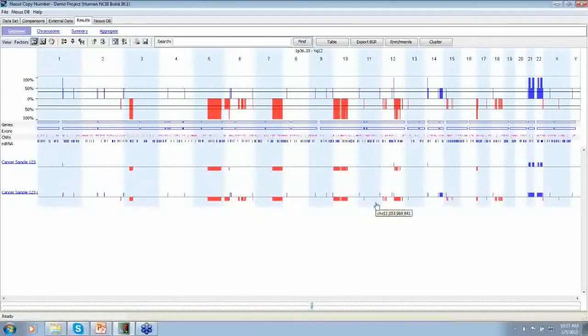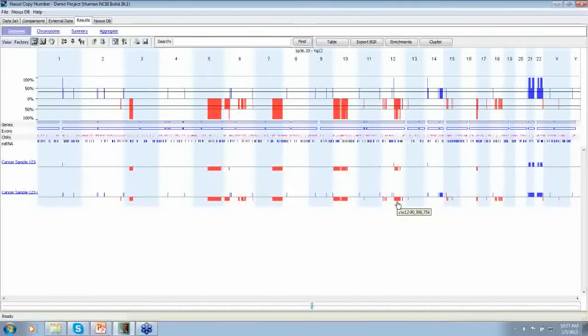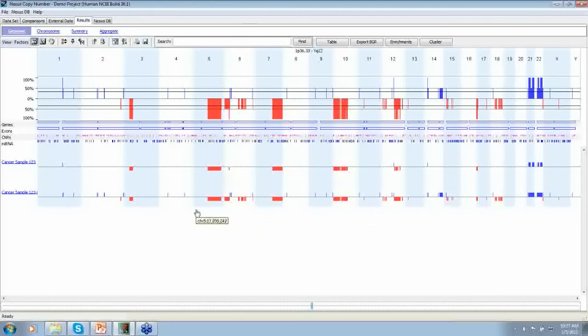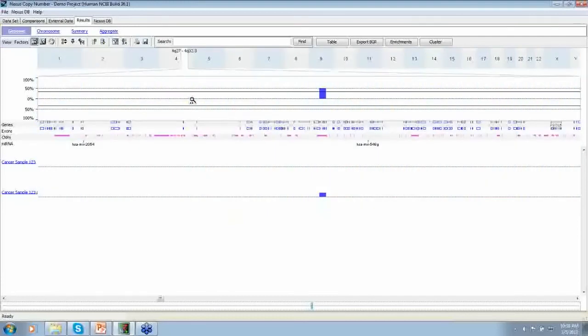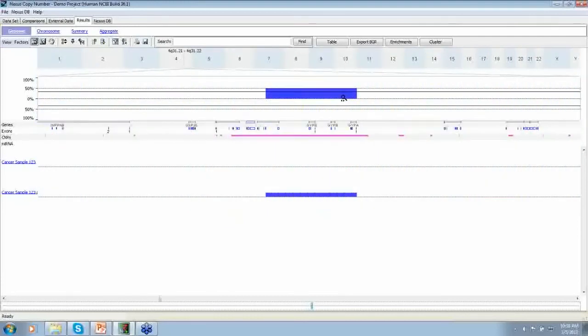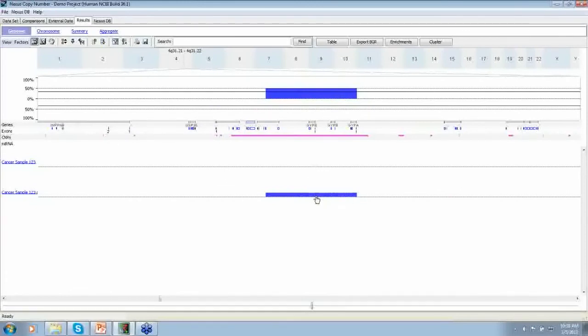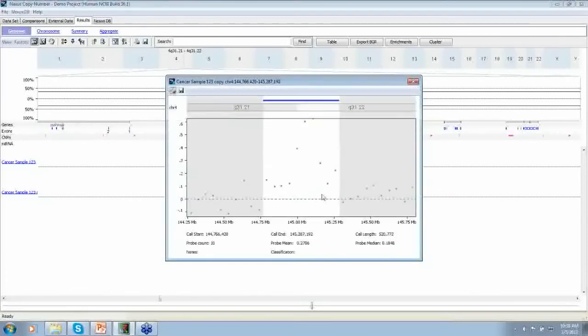The big ones are still there but on 12 we're making more calls, on 18 as well. The downside as you can see or possible downside is we've increased the false positive rates, possibly. So if we look at this area on chromosome 4, previously it wasn't being called but now it's being called as a gain.